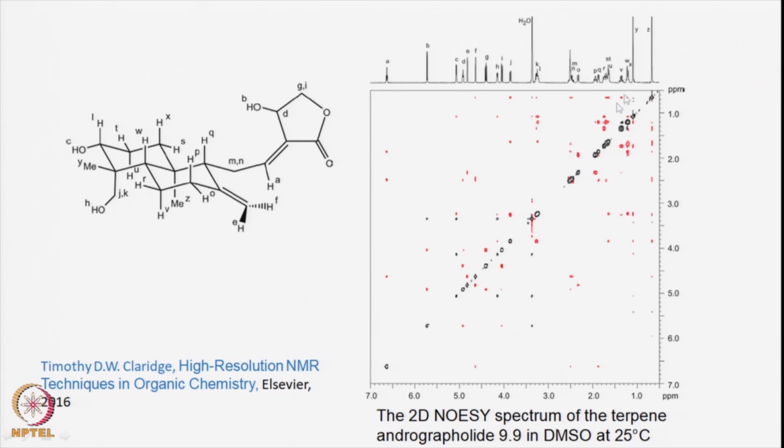So, this is the 1-dimensional spectrum, and you can monitor the intensities of all of these and establish correlations, firstly with regard to which protons are in close proximity. They also have different intensities because they have different interproton distances. By looking at the intensities of the peaks here, you can actually calculate the various interproton distances. So you have so much information here, and all of these peaks are the carriers of structural information. You quantify all of these peaks, then you will be able to establish the network of interproton distances, and it will allow you to determine the structure of the molecule.